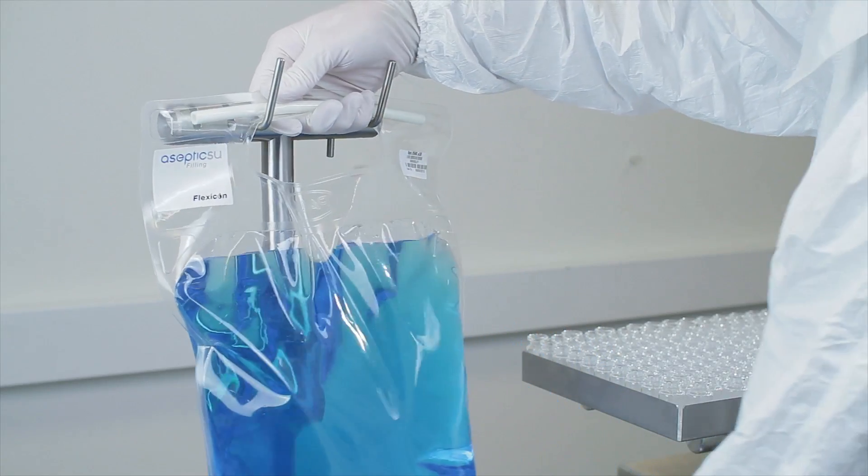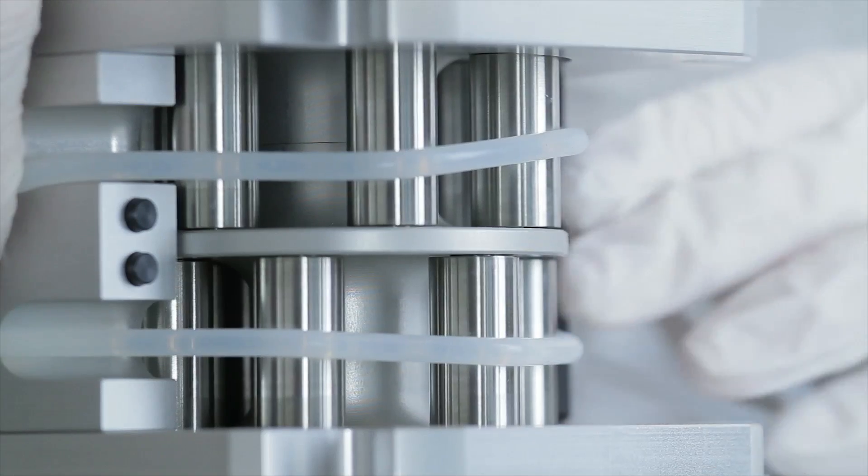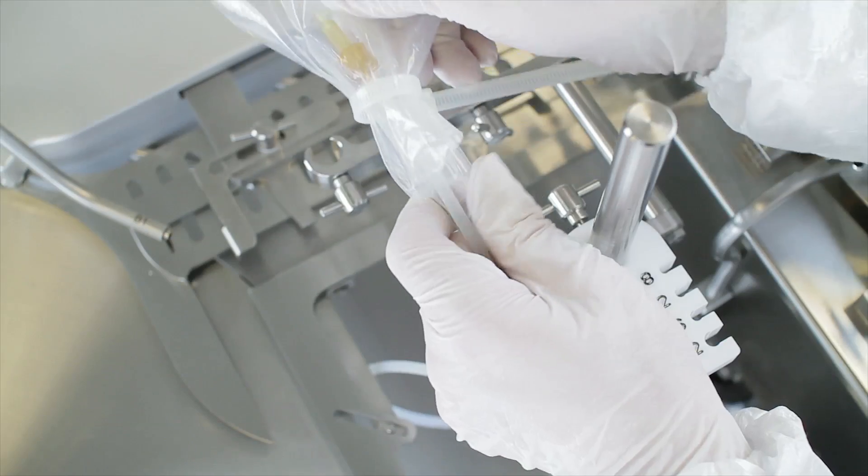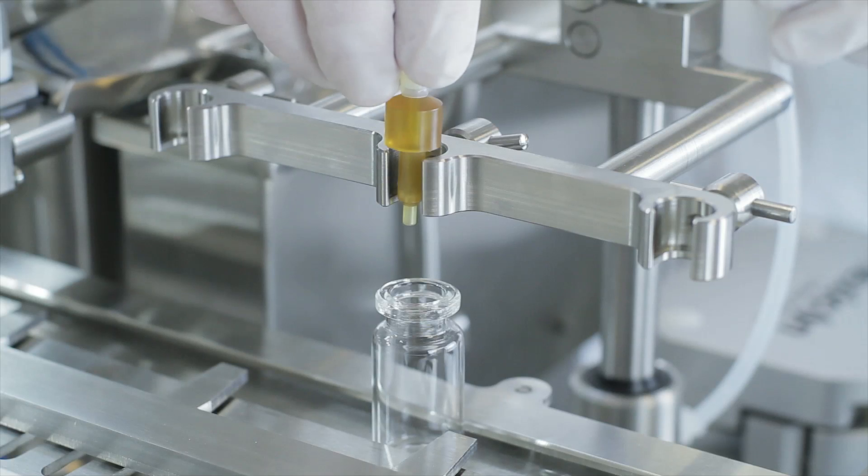The entire fluid path has been designed for single use, making cleaning validation extremely simple and ensuring fast changeover between different types of liquids that need to be filled.